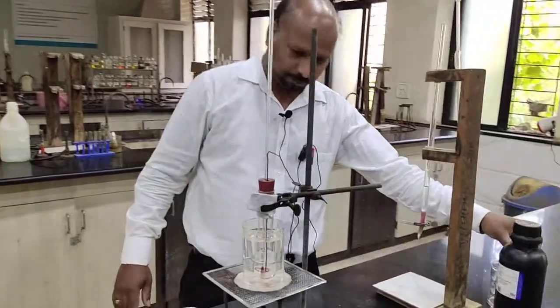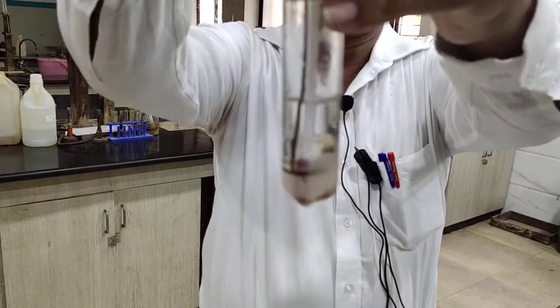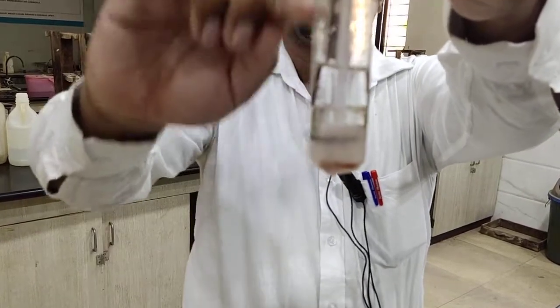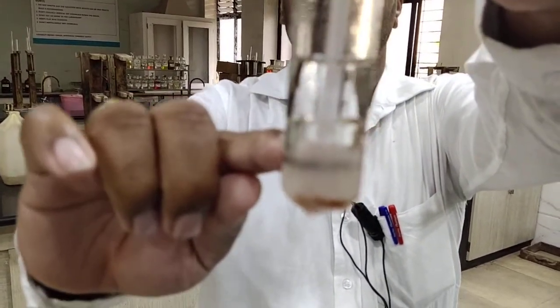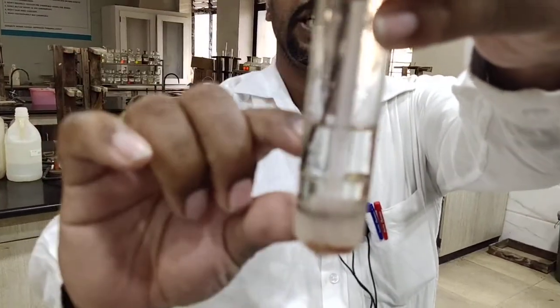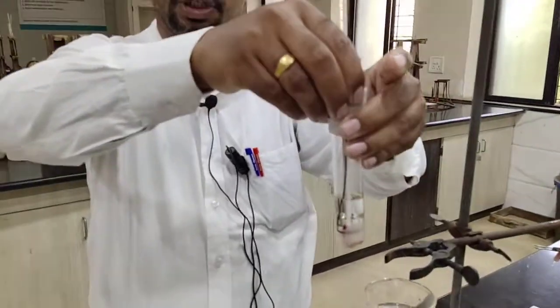Now see here. This is the phenol water system. If you see carefully, in this case two layers are formed. One layer is the water layer, where water is saturated with phenol, and the second layer is the phenol layer, where phenol is saturated with water. So this is a partially miscible system. Now for this system we have to find out the critical solution temperature.